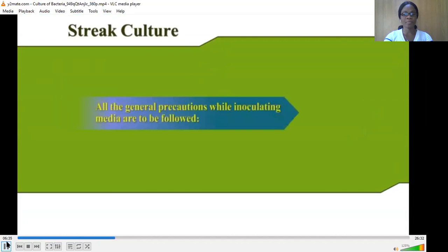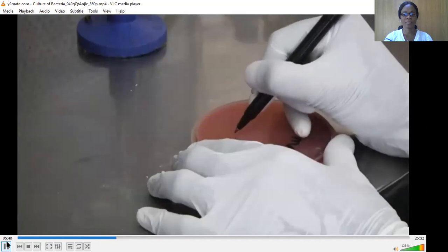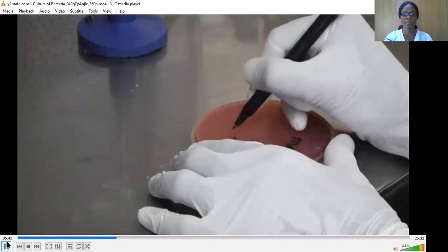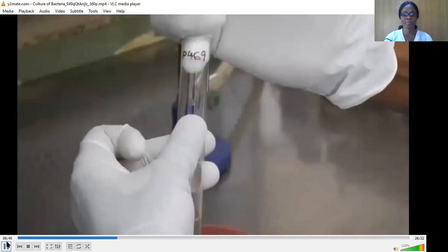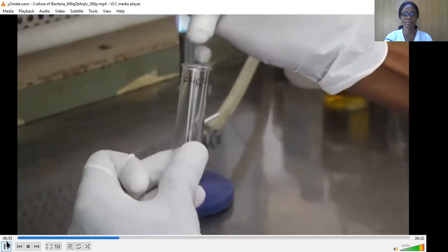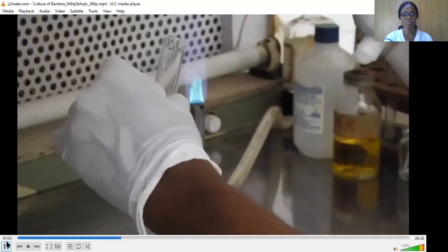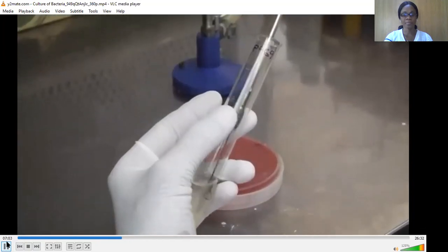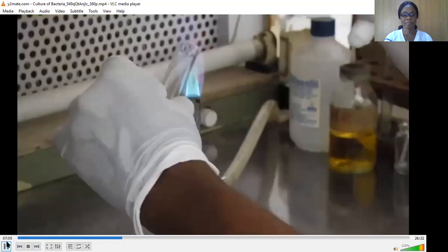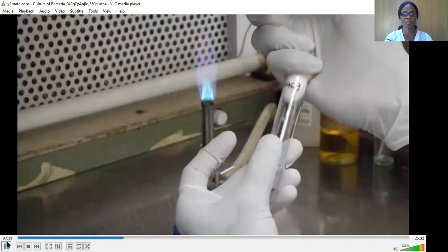All the general precautions while inoculating media are to be followed. Label the base of plate which is to be inoculated before you start the procedure. Loosen the cap or cotton wool plug of the bottle or test tube containing the broth culture. Remove the cap or cotton wool plug of the bottle or test tube with the little finger of your right hand and flame the neck. Load the inoculum onto a sterilized wire loop. Flame the neck of the bottle or test tube and replace the cap or plug.